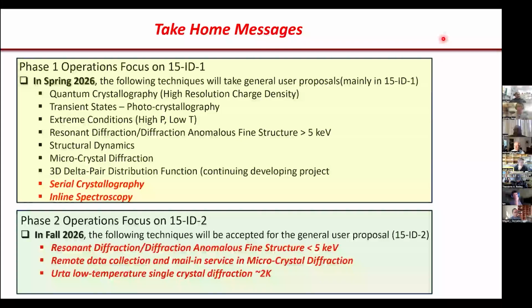Beam damage, right? So that's something we can also try with serial crystallography, and take a shot. If you have a large beam, we can put the beam on your crystal and take a scan quickly. That's another option we can do. If it really cannot be done with a small beam, meaning the crystal decomposes, we can enlarge the beam to reduce the flux, then we can do some serial small molecule crystallography and try to get the structure coming out from that.